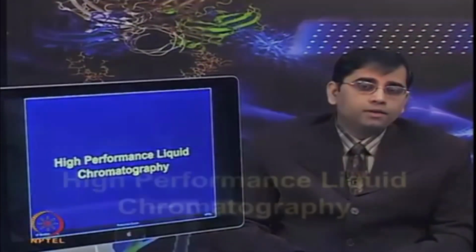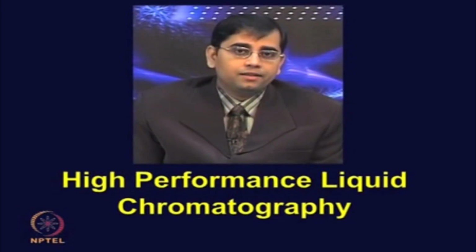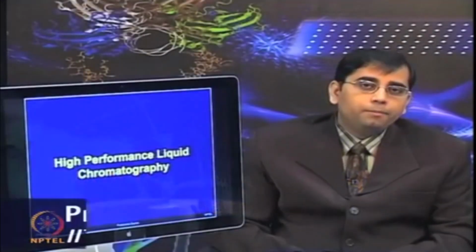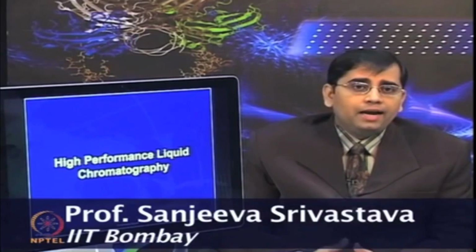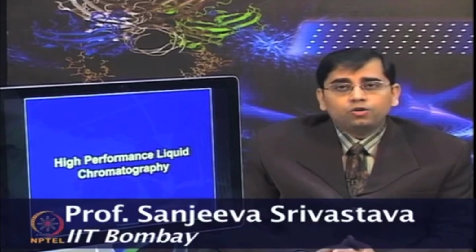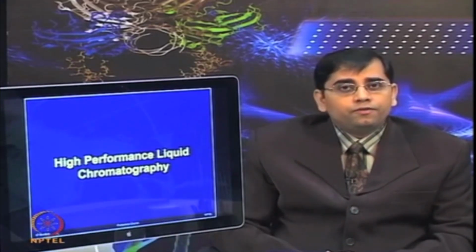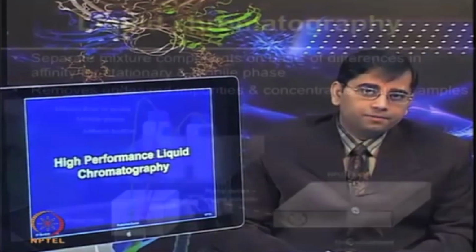Let us now talk about high performance liquid chromatography, HPLC. HPLC is a separation technique that separates molecules based on their differential adsorption and desorption between the stationary phase matrix in the column and the mobile phase. Better separation and resolution of the components can be achieved by HPLC.